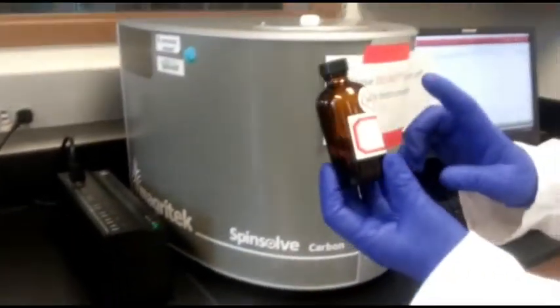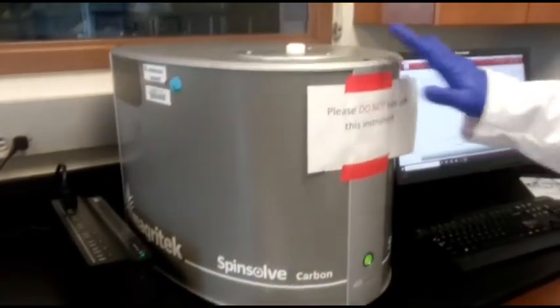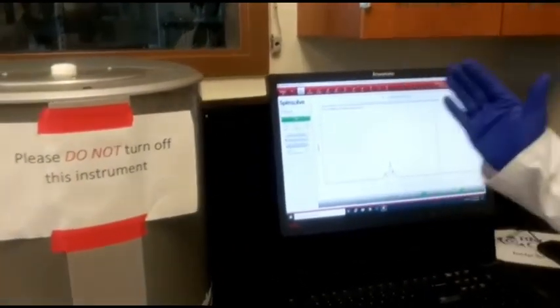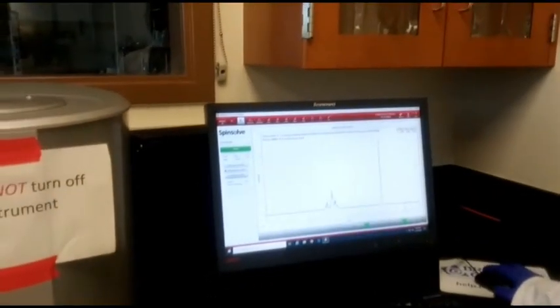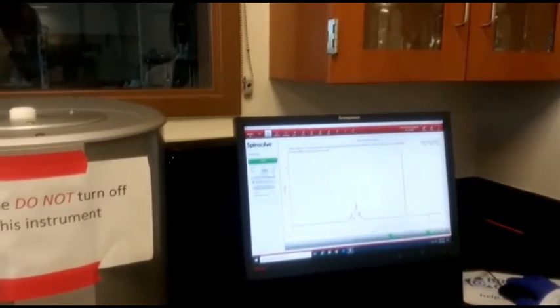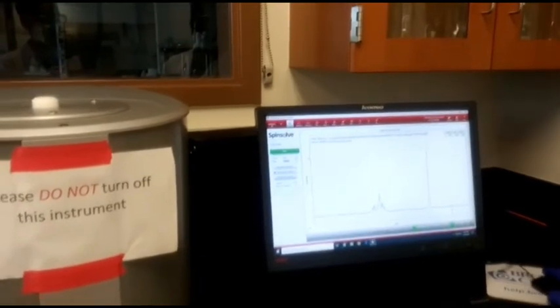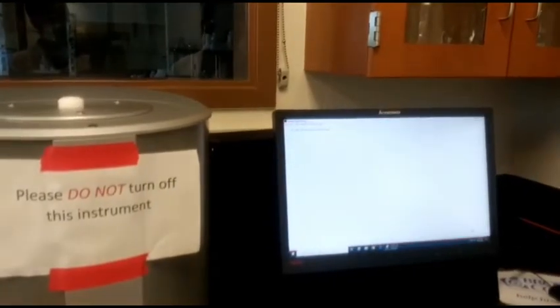I used this deuterated chloroform as the solvent. I prepared the sample, and then I recorded the NMR here. So this is the NMR of acetylsalicylic acid in deuterated chloroform as the solvent. So you need to characterize all the peaks that are necessary there. Okay, so I will just give the printout here, and you will have this in your D12 also. It will be printed there.